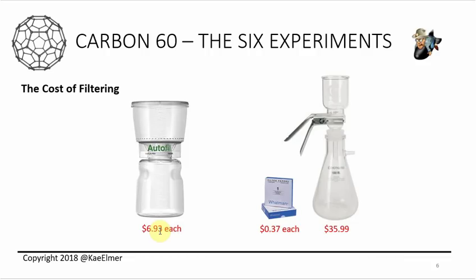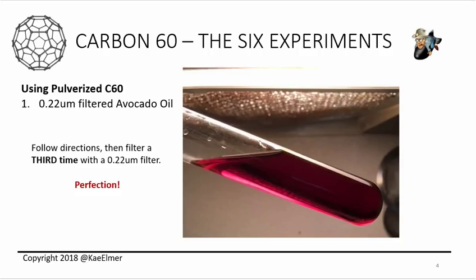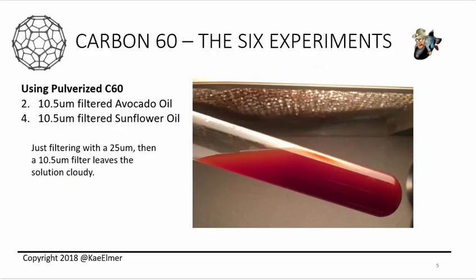So that's another thing I want to share with you: buy the .22s, use them on your pulverized C60 as your third filter. Use this rig. It's so much cheaper if you use paper filters, and then that way when this gets blocked you have to throw it away. So it's cheaper to throw a piece of paper away than it is to throw the whole filter thing away, and that's how you get perfection. That's avocado and sunflower oil experiments 1, 2, and 4.